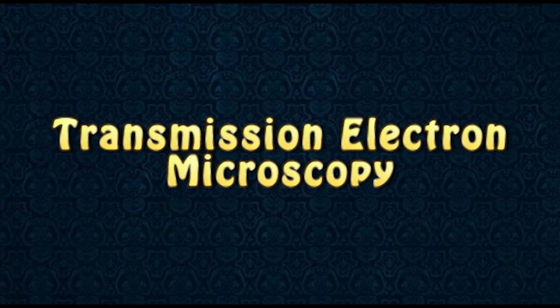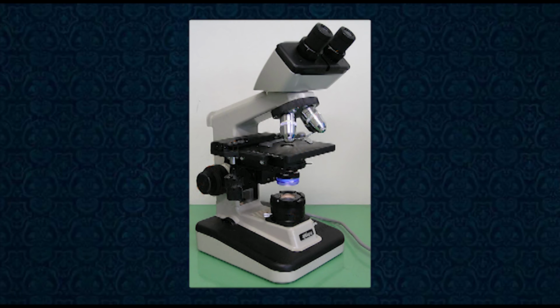Before the invention of the transmission electron microscope, the only method for obtaining magnified images of small samples was through the use of an optical microscope. These are the microscopes that we're all already familiar with, making use of the witchcraft known as bent glass to manipulate light and provide a generally larger image of whatever specimen one inserts into the apparatus.